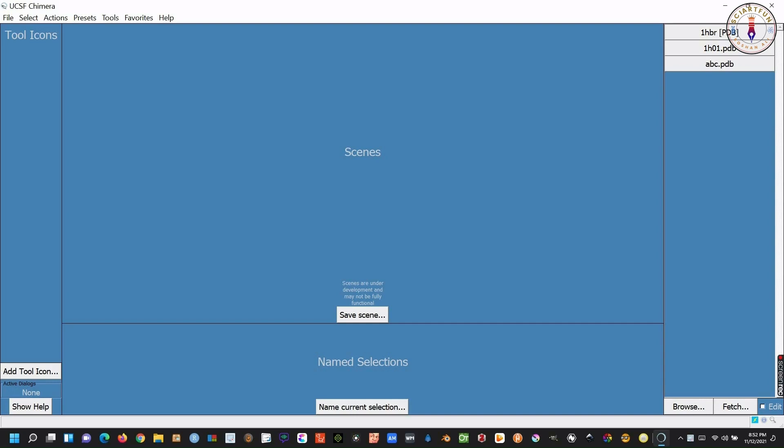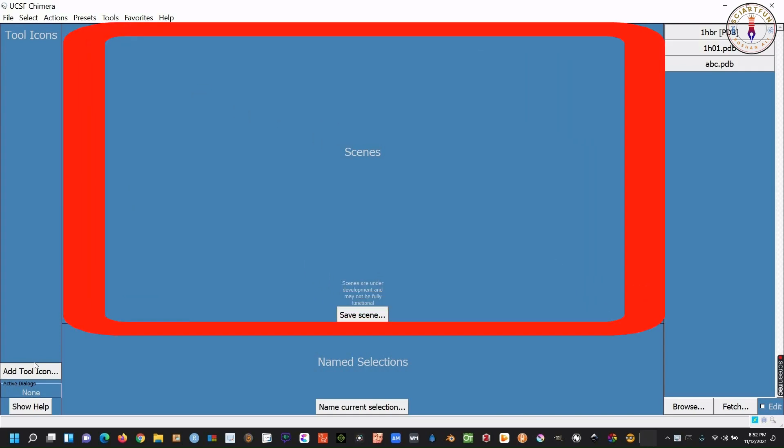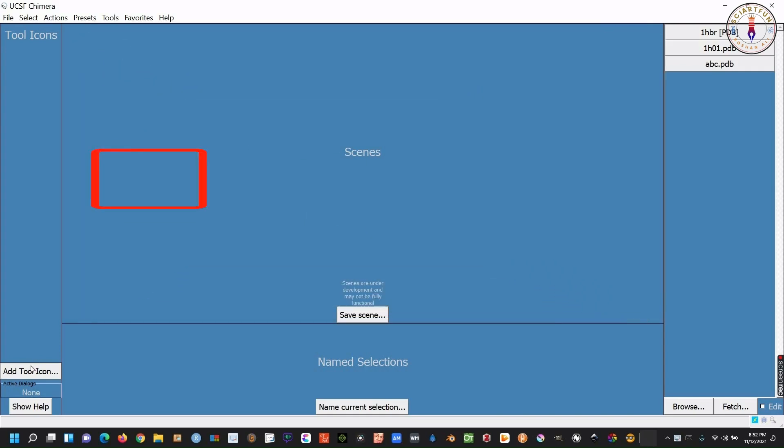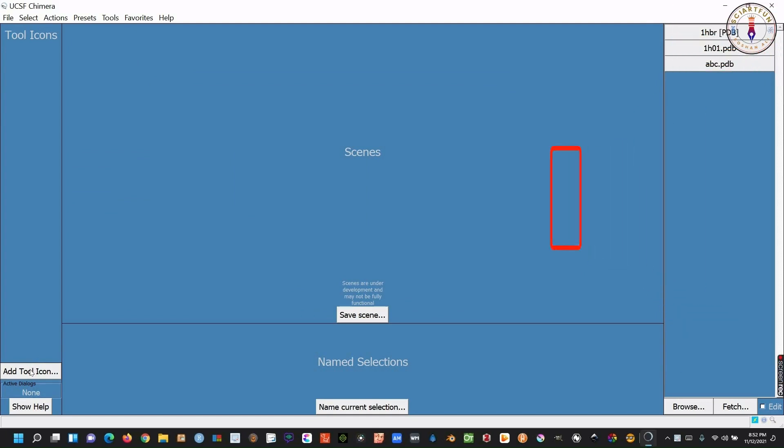This is the interface of Chimera 1.15. You can see the interface is divided into several blocks. This block is for tools icons. I will show you how to add tools icons in this box. Below this is the help box. In the center, this upper window is called scene window, where your molecule structure will be visualized. This right upper window shows the history of scenes you recently opened. You can see it is showing three molecules that we have recently opened in the scene window.